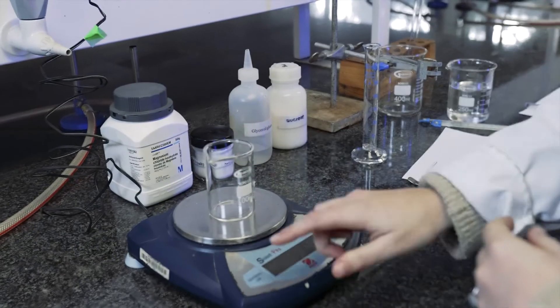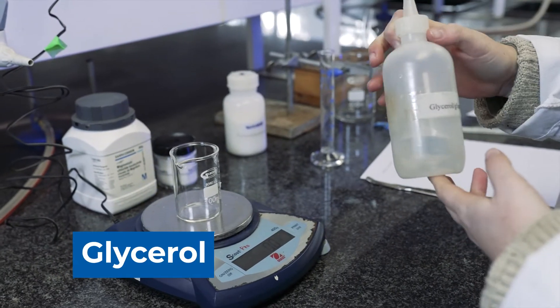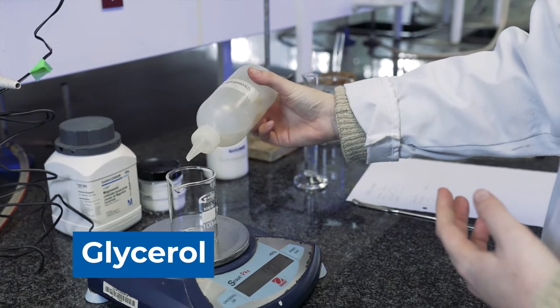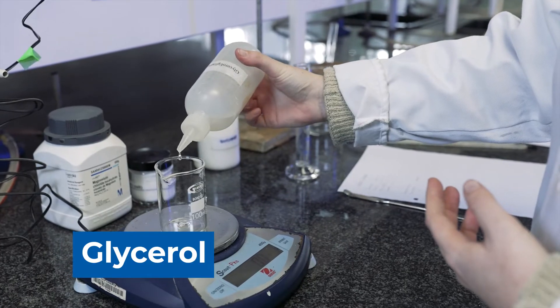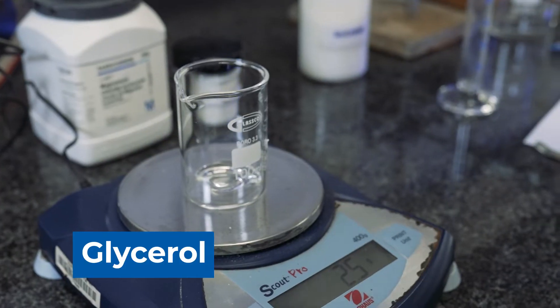Now we are going to weigh the glycerol. With glycerol you need to be careful as it's a liquid, so you can't just add too much and then pour it back into the bottle it came from. You need to be especially careful when adding glycerol.